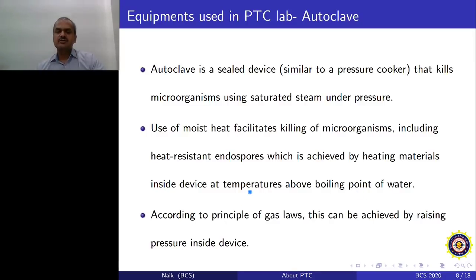Now this is according to the principles of gas law. Moist heat at a temperature of 121 degrees Celsius can be achieved by raising the pressure inside the device.